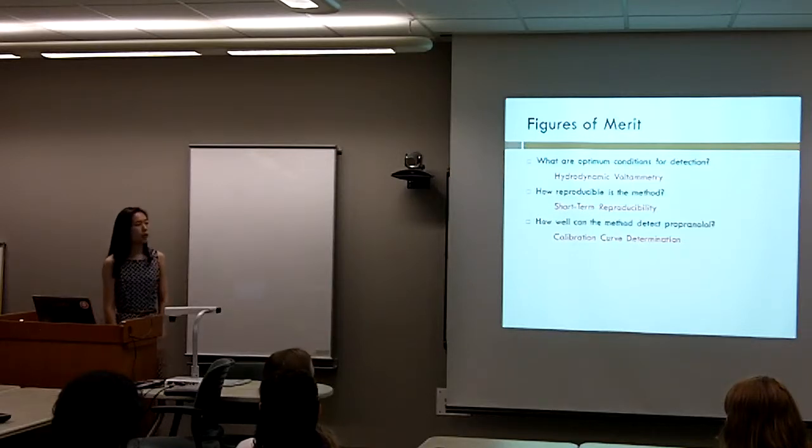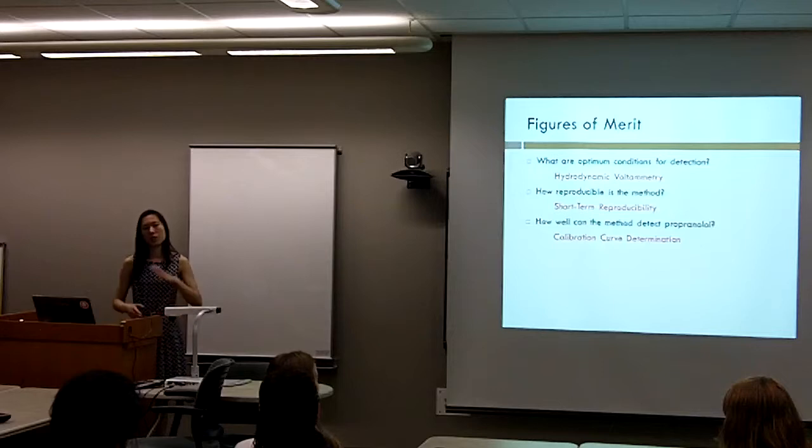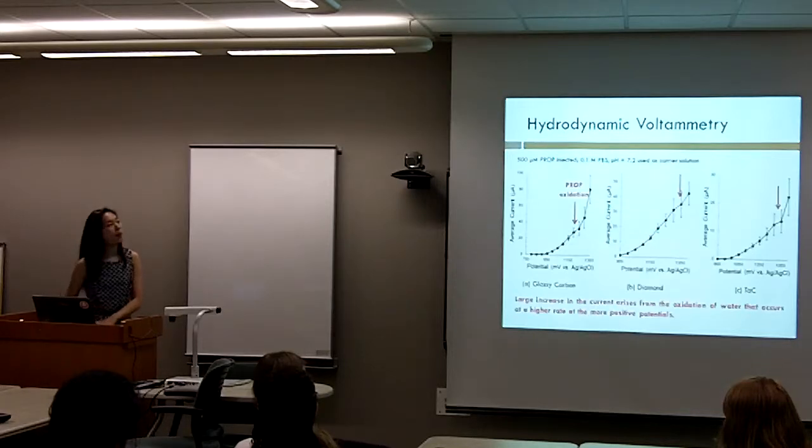And the last experiment I run is known as the calibration curve determination experiment, which tells me how well the method can actually detect propranolol in terms of distinguishing between signal and noise and how wide of a range it can actually detect. So the first experiment, hydrodynamic voltammetry.